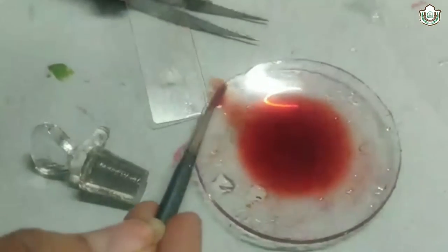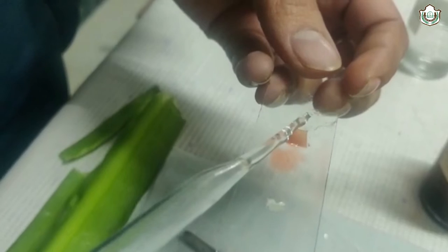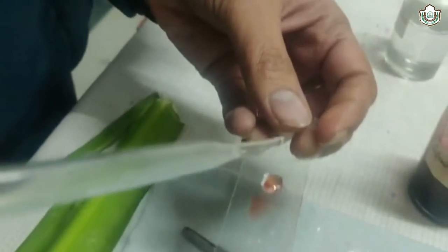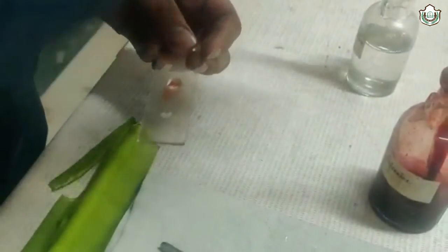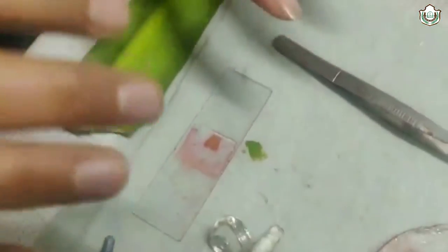Now place it on the microscopic slide. Put a drop of glycerin over it and place the cover slip at 45 degree angle. Now observe under 10x microscope.